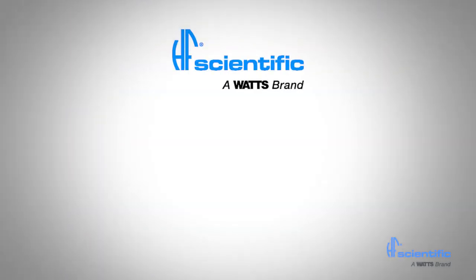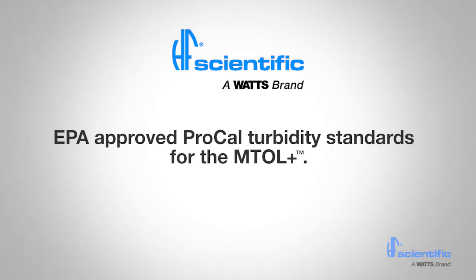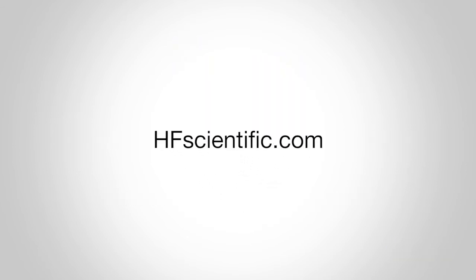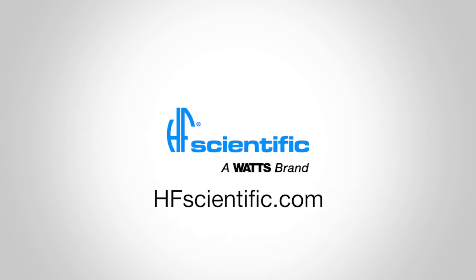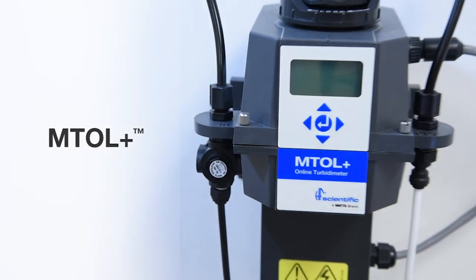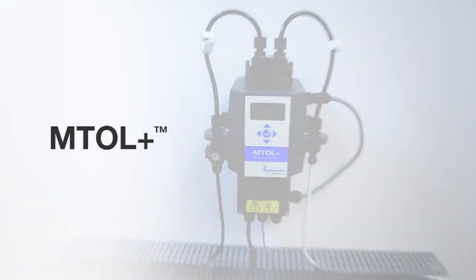HF Scientific manufactures EPA approved Pro-Cal Turbidity Standards specifically for the MTOL Plus. Traditional standards can be used if desired. For more information about the MTOL Plus and other HF Scientific instrumentation, visit our website or contact your HF Scientific representative. When your application requires online turbidity measurement, all you need is the MTOL Plus.